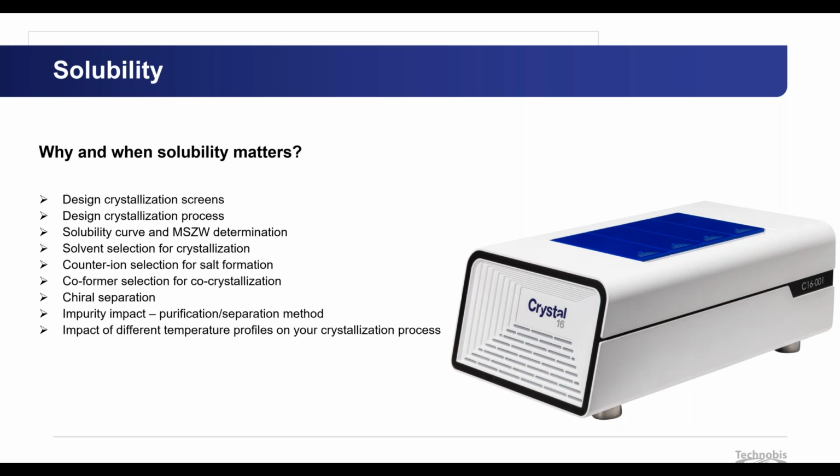Your future experiments, depending on what they will be, could be a crystallization screen or process, you would like to make a salt, you would like to go towards co-crystallization, or you have a chiral compound and you need to look into chiral separation, impurity.